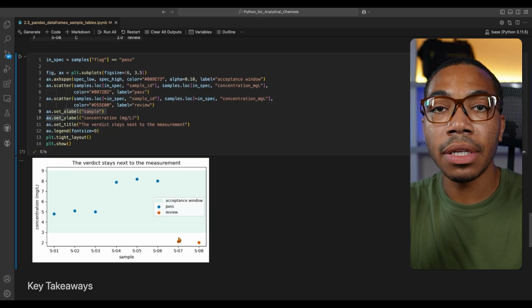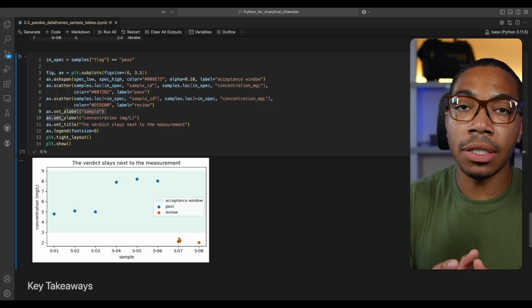They could be low because they were improperly diluted. They could be low because the instrument wasn't performing well. There's all sorts of ways where we can generate additional flags, or they could be low because the new analyst is not properly doing the sample prep. But now you can see how we can take these powerful tables where we have the measurement data and the metadata combined to do feature engineering or to develop enhanced figures, and even more than what's in this notebook.